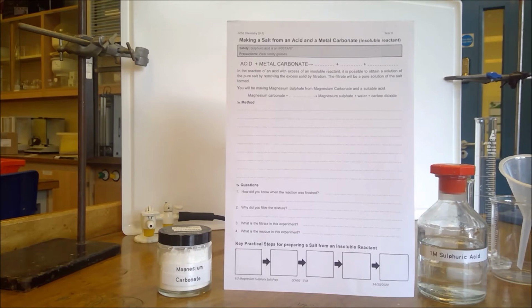Today we're making a salt from an acid and a metal carbonate. So our metal carbonate we're using is magnesium carbonate, and that is insoluble. So we're going to be reacting that with an acid, and as it's reacting we need to consider what we're observing and how we know when the reaction is complete, and then we need to consider the steps that are taken so that we can produce a pure dry sample of our salt.